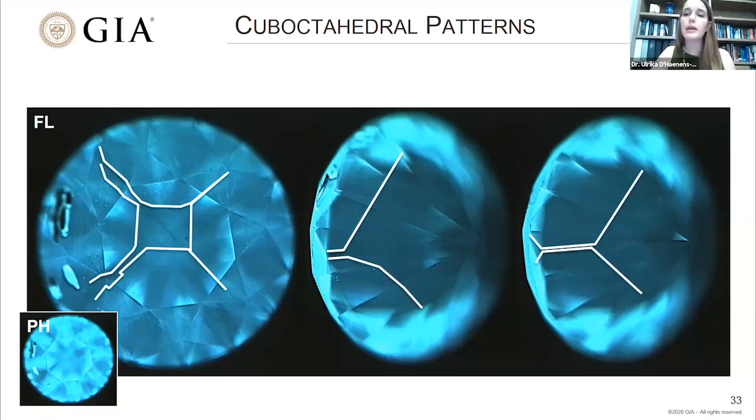And this is a very high purity stone. So this would be a type 2 diamond, which if you were looking at a natural type 2 diamond, you would be expecting to see blue fluorescence patterns and that they would be these dislocation networks, this web-like pattern. So again, very different to what we observe in natural stones. So it immediately tells us that this is a man-made diamond.